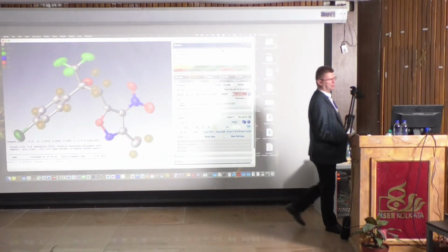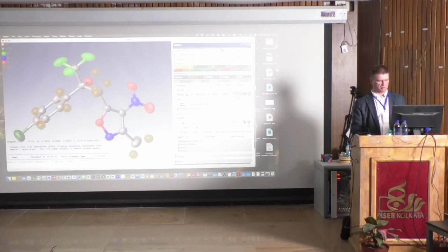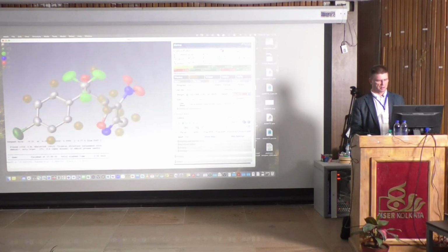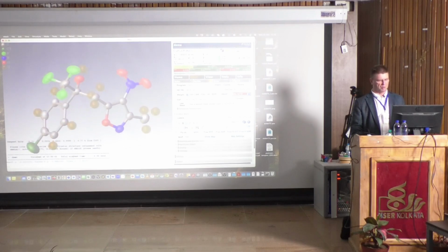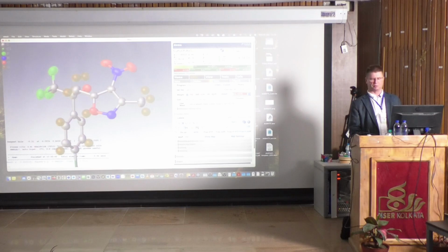And now you can see what happens. It's already assigned because I have here 11 peaks. So you can see now that, yes, there's one addition here. This is clearly a ghost. It's not real because there can't be any hydrogen attached to this carbon. But you can see here, this is nice. We can see a ghost. Obviously they are hydrogen atoms.